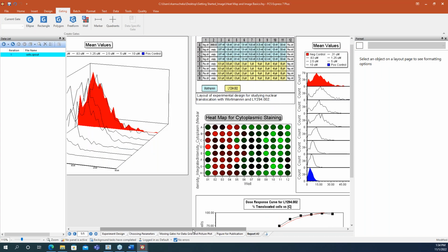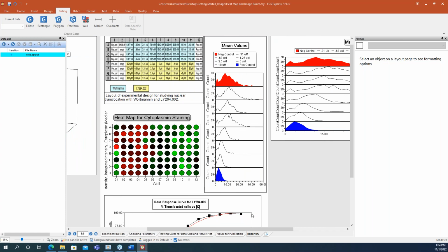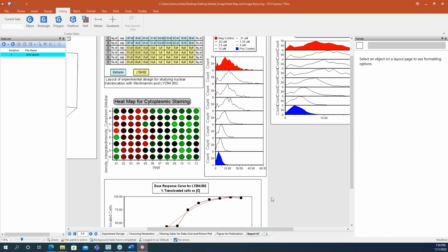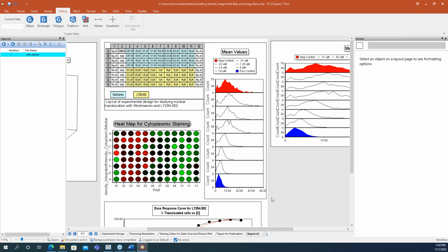Now here we're going to look at the report page. This is kind of the summary page for their analysis. One thing that's nice is in these reportables that we're going to create next, you don't necessarily have to report out everything. You have the flexibility to report on one page, report all pages, to compare things side by side and get the most out of these reports.